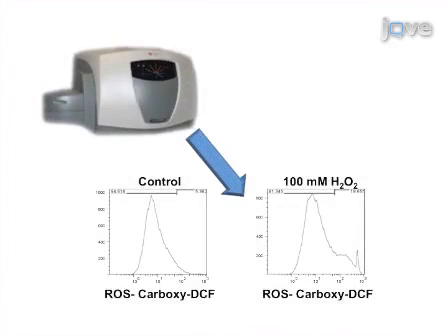The cells are then harvested, and fluorescence is assayed by flow cytometry. The number of fluorescent cells indicates the number of cells that are in an oxidative state. The aim, of course, is then to detect which specific oxygen radicals are present in the cells by using different assays.